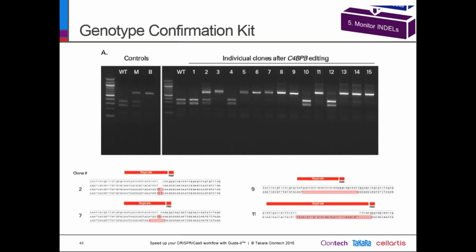And many of our cell lines which are broadly used in cell culture are not really diploid. So this could be the case. This could also happen if your clone was not originally isolated from 1 single cell, but was maybe a mix of 2 cells. So it's very important to have a clean clone at the beginning.